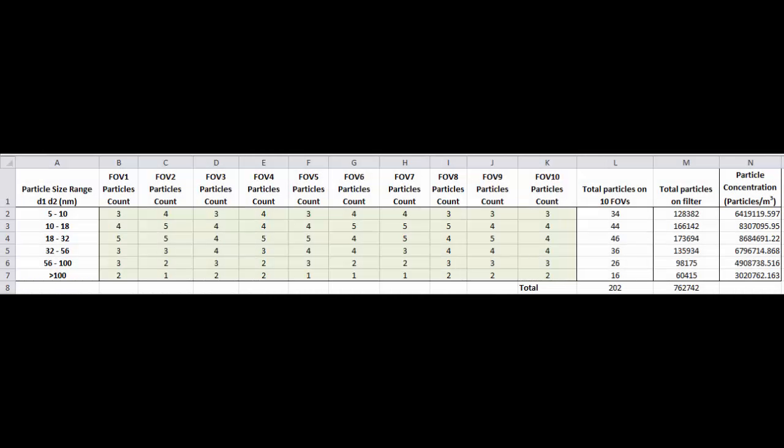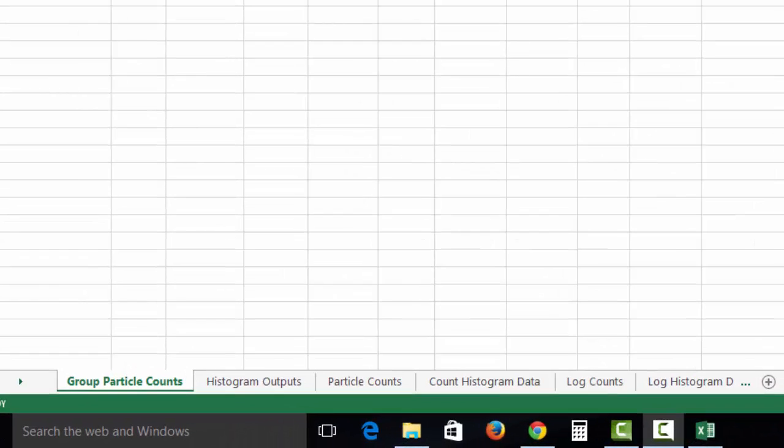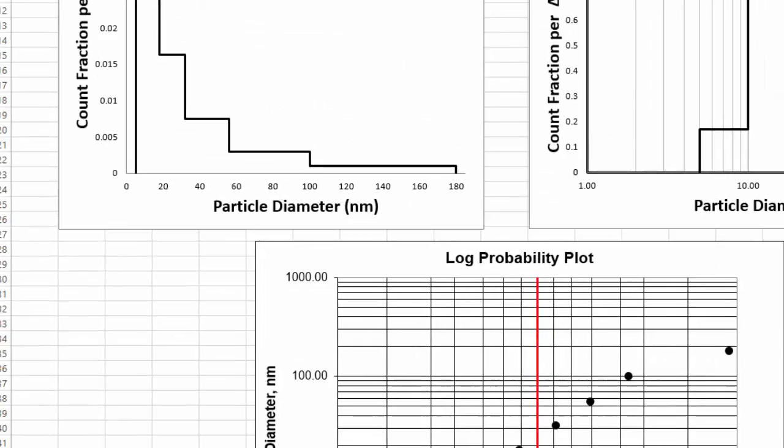The class should then come together and add the distributions from all of the field of view images to the Excel sheet provided with this module. Once this is complete, you can click on the second tab on the bottom labeled Histogram Output. There you can see the first graph, which is a histogram of count fraction per micrometer versus particle size.